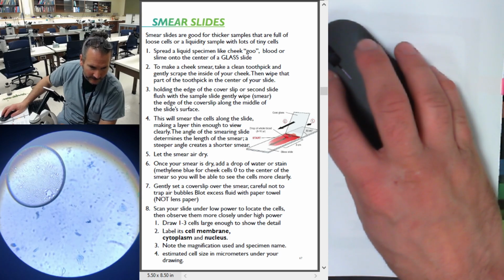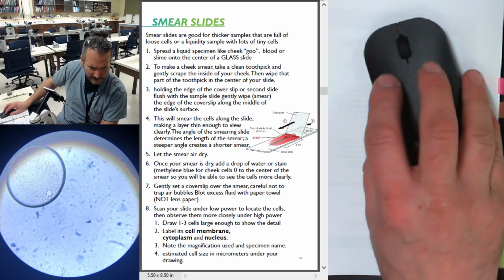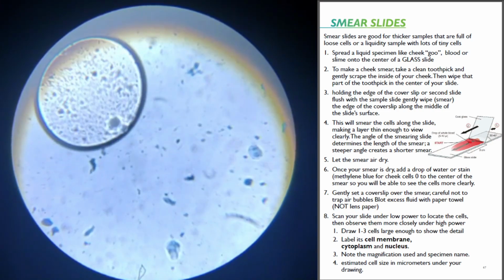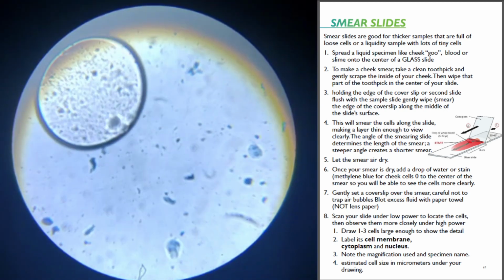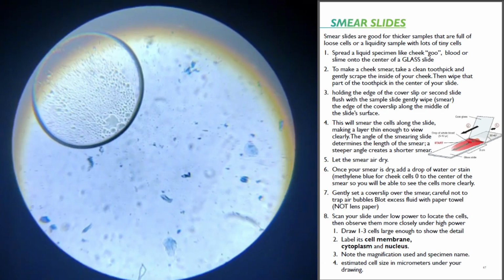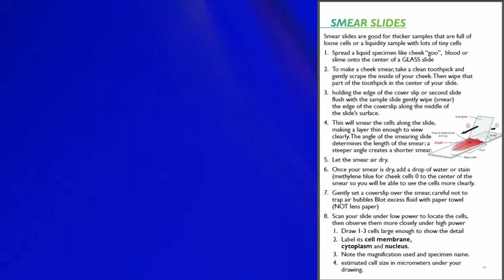Get a little bit bigger picture of that. Now I'm just going in and out, and I'm looking for anything that looks like it's moving. Not really. Okay. So we're at 10 objective, 10 ocular, that's 100 times total magnification.